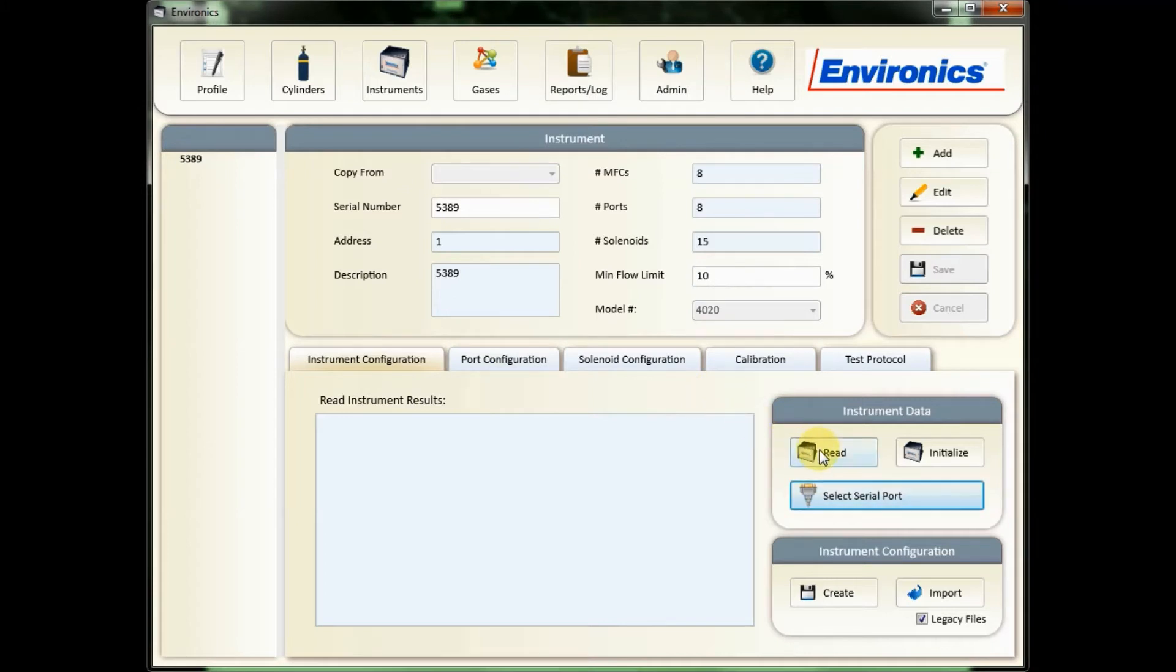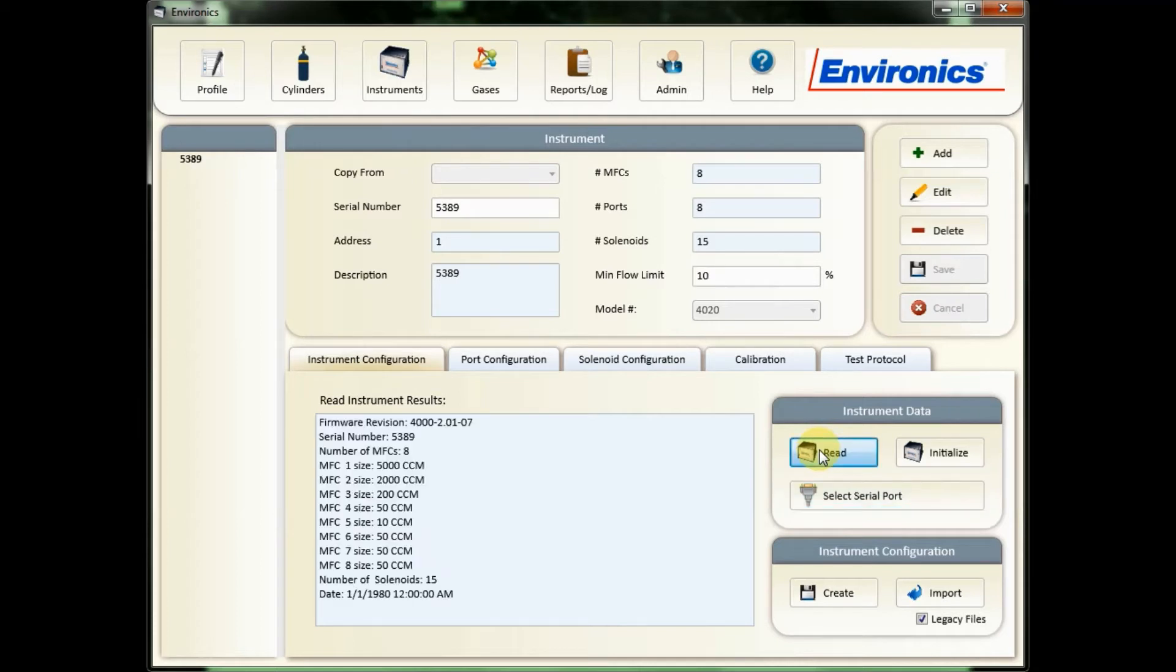You can then read your instrument, which will show you first that your unit is connected properly. It will also give you some basic information about the unit: the firmware, serial number, the number and sizes of your MFCs, and the total number of solenoids.